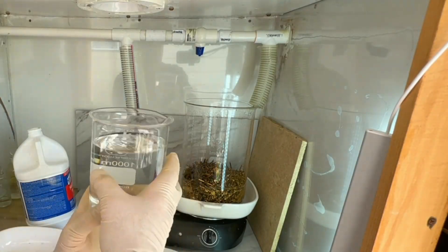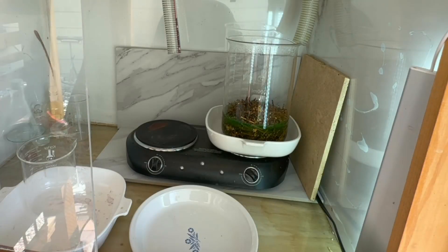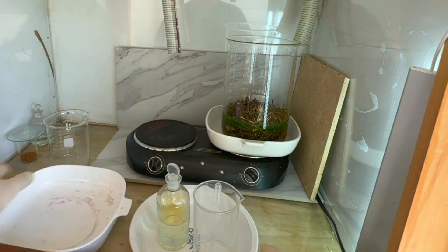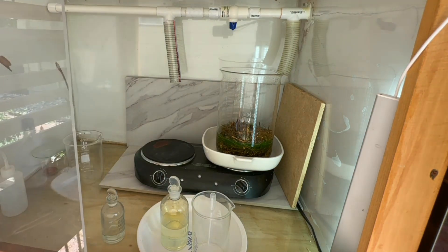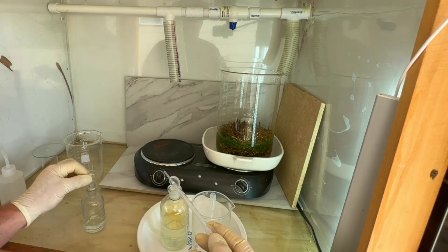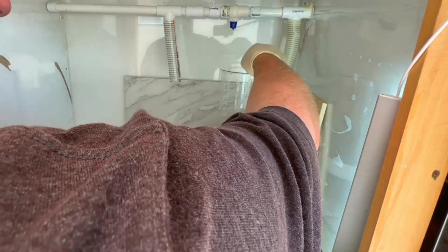We'll put the beaker up on the hot plate and add about a liter of hydrochloric acid to start our aqua regia process. We'll add a couple shots of sulfuric acid to drop any lead that may have carried over from the RAM fingers themselves, just to make sure that lead drops out as lead sulfate. Then we'll add our nitric acid to kick off the aqua regia — putting about 10 milliliters in to start.